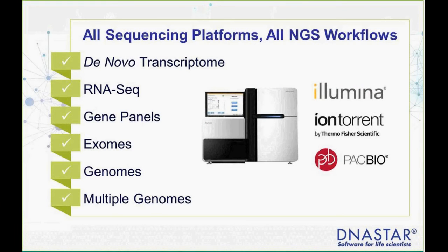And one of the first things I'd like to reinforce is the idea that we've developed these tools to be compatible with all the different sequencing platforms and all the different NGS workflows. And of course, there are all different types of workflows, ranging from de novo transcriptome to RNA-Seq to panels to genomes and multiple genome comparisons. And sometimes you want to do a little bit of each.